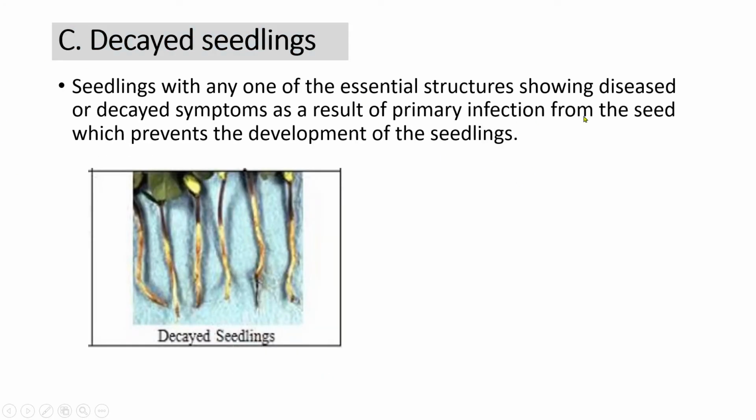Decayed seedlings are those especially infected by disease of any kind. It may be bacterial, or it may be fungal.